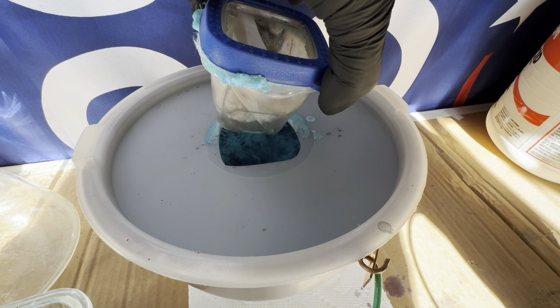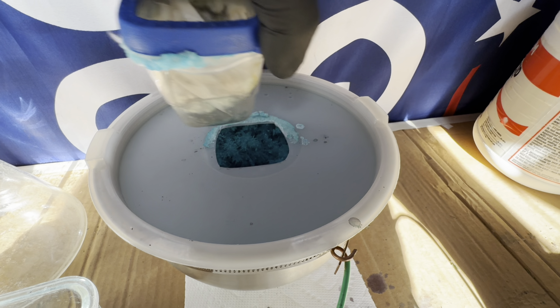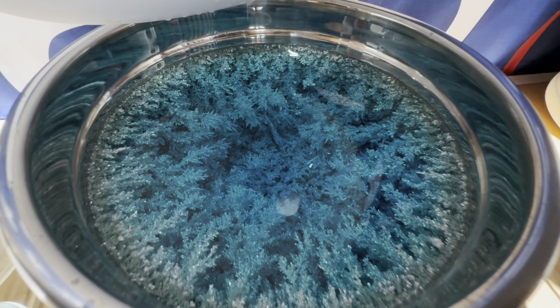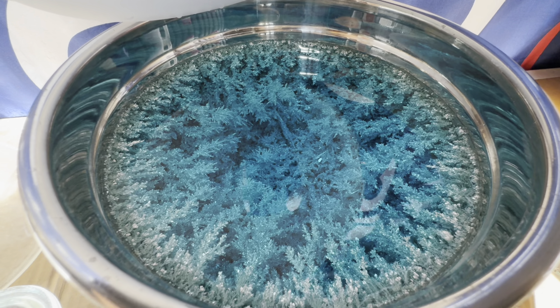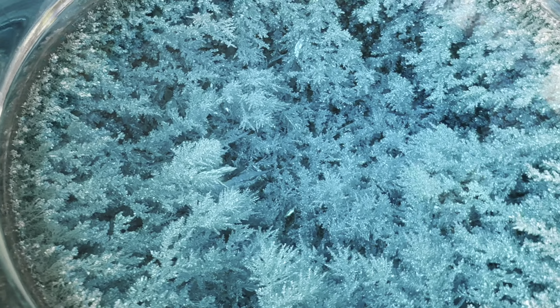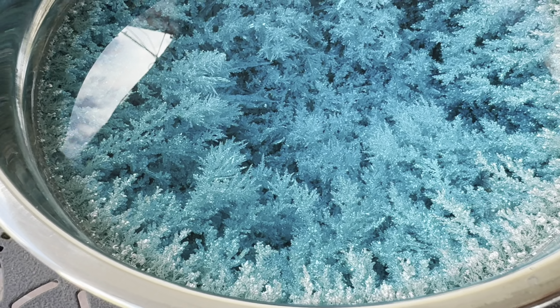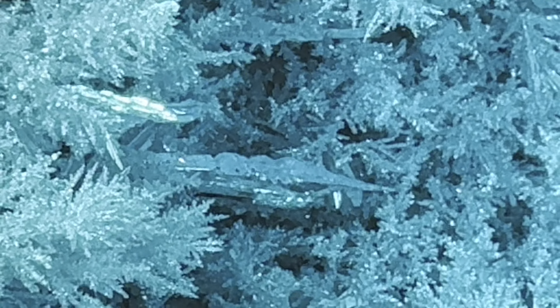Let's go ahead and pull this electrolyte basket out of the electrolyte and see what we've got in here. Holy moly — that looks perfect. Let's get it out. There's a look at the pure silver crystal, and it looks just beautiful.